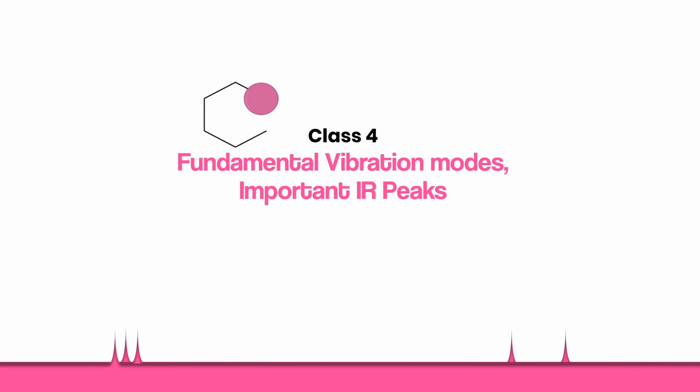In our previous discussion we talked about IR spectroscopy and different kinds of modes of vibration. In this class we are talking about the different fundamental vibrational modes, and we will discuss some important IR peaks that you have to remember, because those IR peaks are very useful when you are solving IR related questions. So first we are talking about the fundamental vibrational modes.